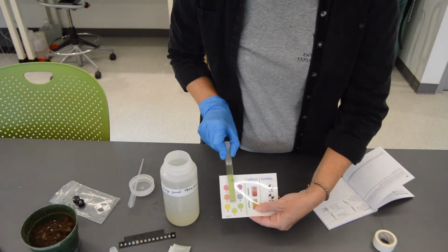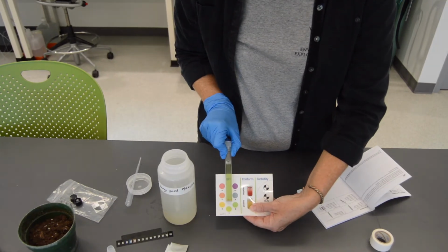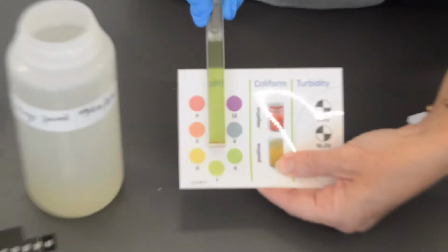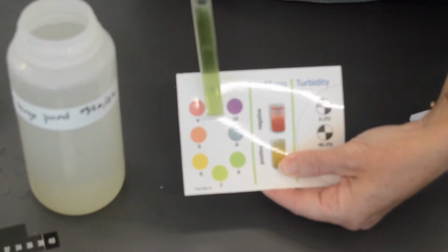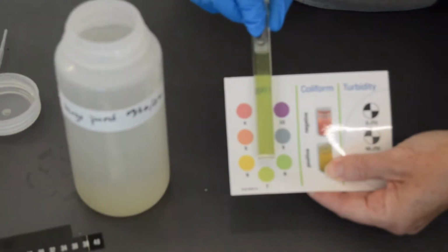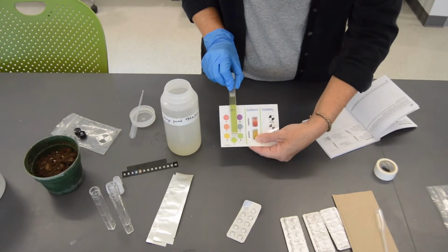And so you can see that we are generally probably just between 7 and 8. But again, it's a pretty simple test. And so 7 and 8 seems like a pretty healthy place to be because it's neutral.